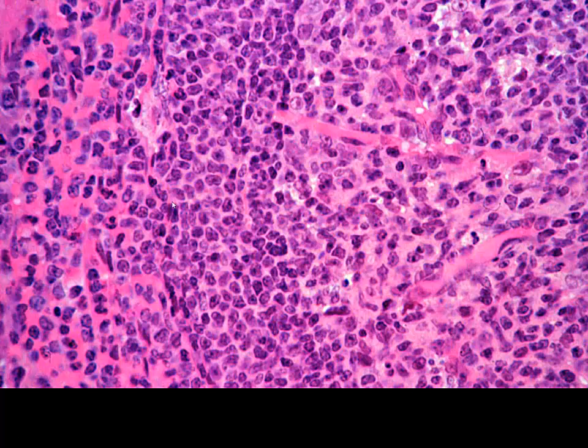Once again, we see our radial arteries. We saw this one in our lecture podcast. This is going to be coursing through our white pulp. This is like the germinal center. Here we have sort of our coronal region of the white pulp. Where marginal zone and the red pulp starts and stops is very difficult to tell. That's just a very gray transitional area, but we can certainly see our red pulp in this particular image.